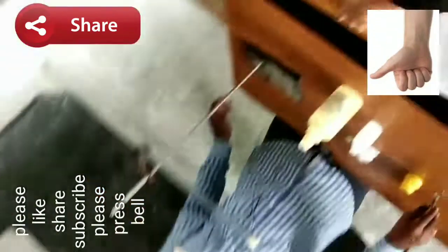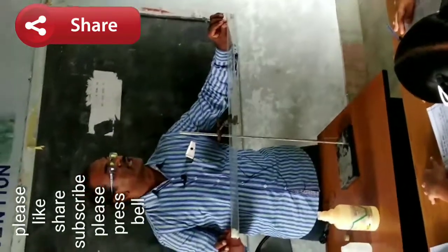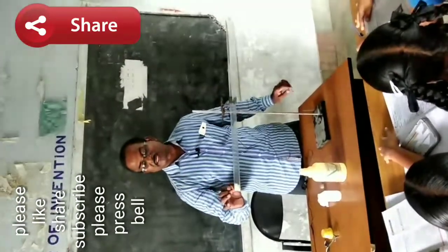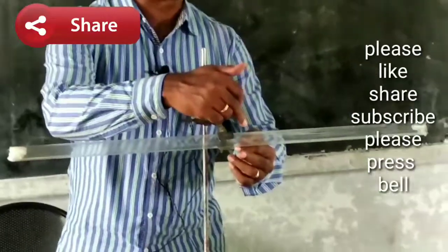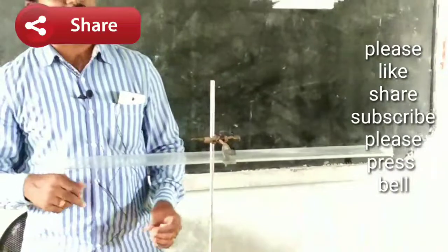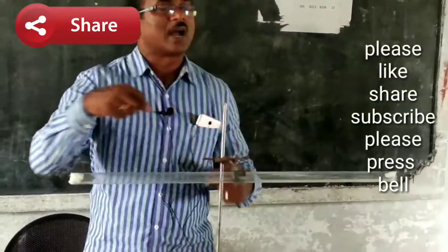Now observe what happens inside the tube. This is the hydrochloric acid ball and this is the ammonia ball. Ammonia slowly diffuses into the gas in this direction, and likewise hydrochloric acid diffuses in this direction. Both gases diffuse into the glass and they react with each other at a point inside the glass tube, forming ammonium chloride white fumes — a white ring forms inside the tube after a few minutes.